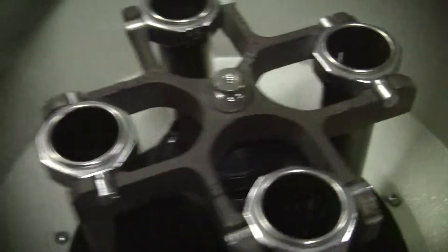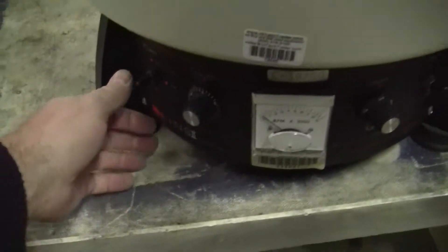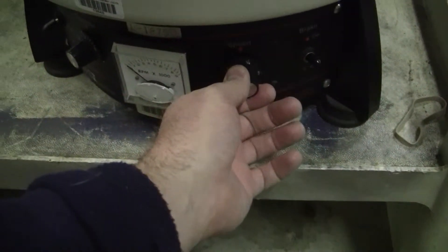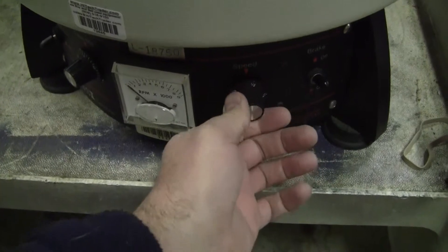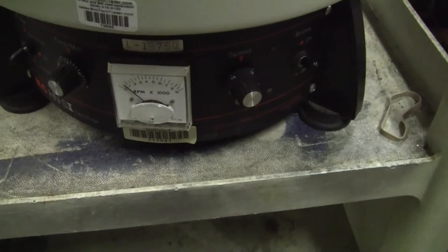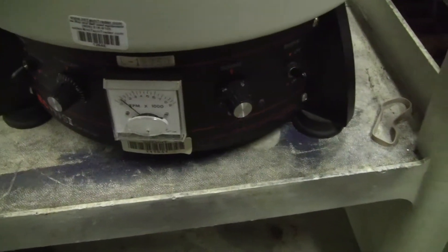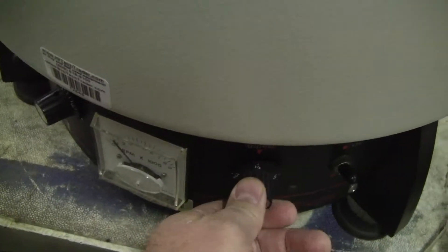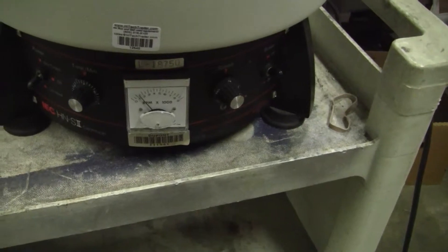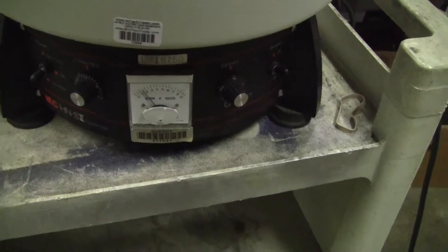Anything else? Let's get it started. It's working very nicely. I'll open it up.